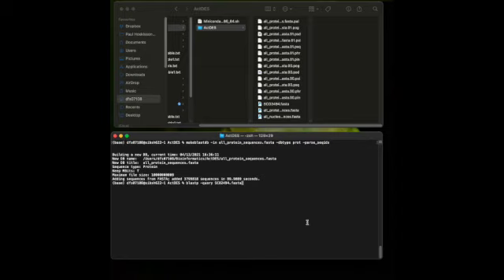And then you need to tell it what the database is. So the database is all protein sequences .FASTA, and then we need to specify the cutoff values that we're going to use for our proteins. So the E value, we'll set that at 0.1. This is where you'll need to hone your searching of the database, and you can only really do that by blasting the database and then going back and looking at the sequences that you retrieve from your BLAST database.